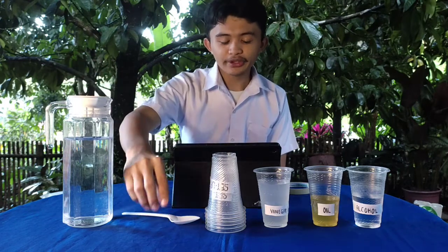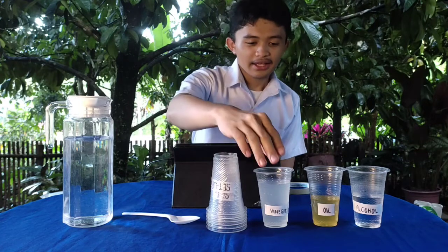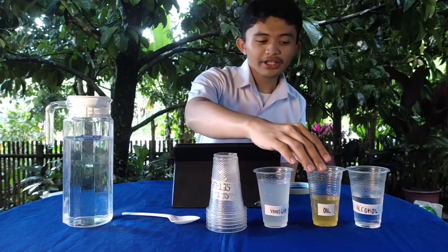We have our materials: water, spoon, disposable glass, vinegar, oil, and alcohol.